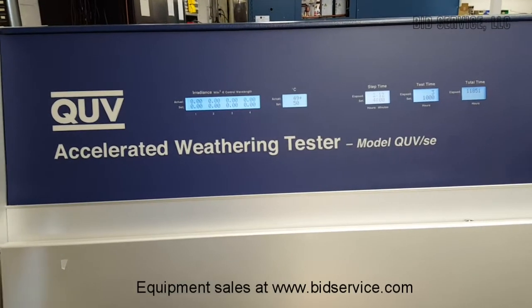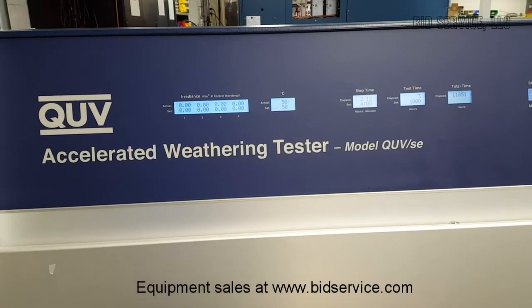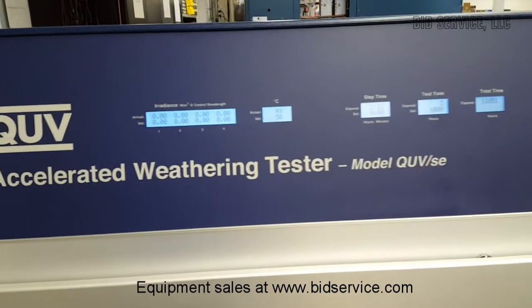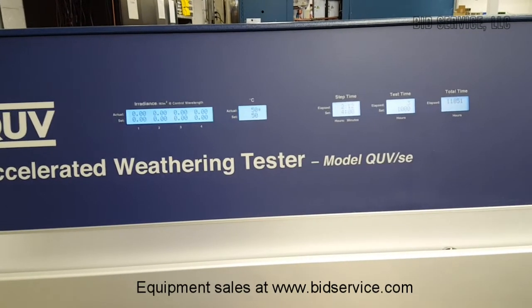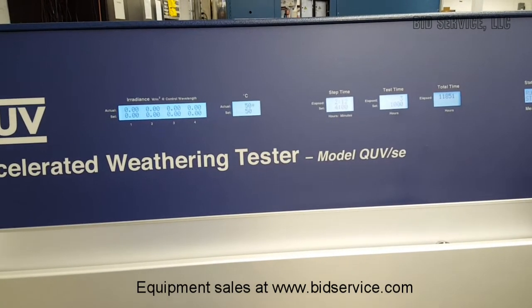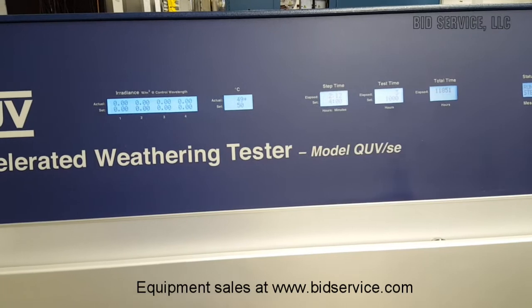This is the QUV Accelerated Weathering unit. This model has the ability to do both condensation and UV weathering. I'm showing it in the condensation mode first.